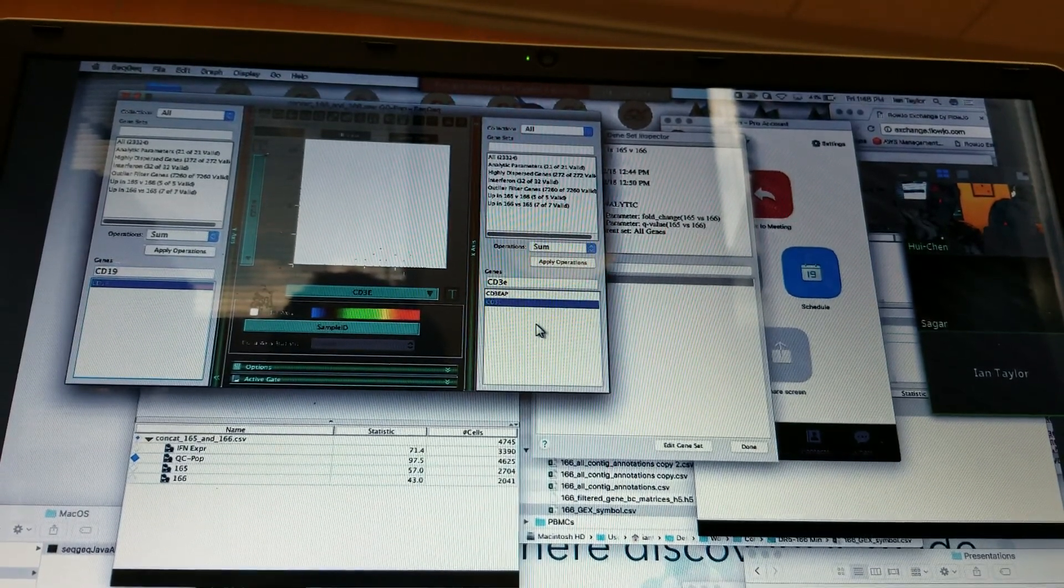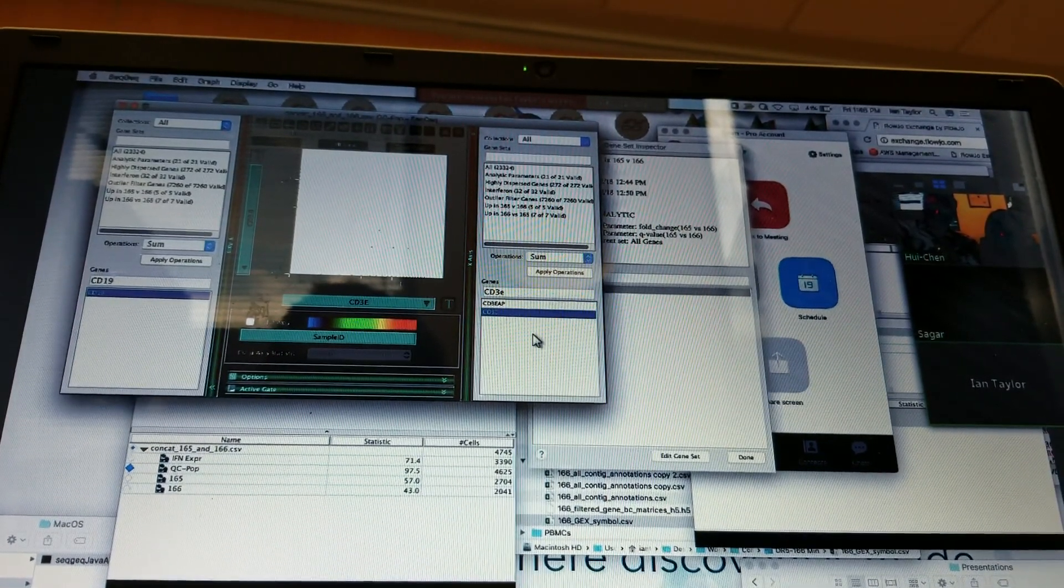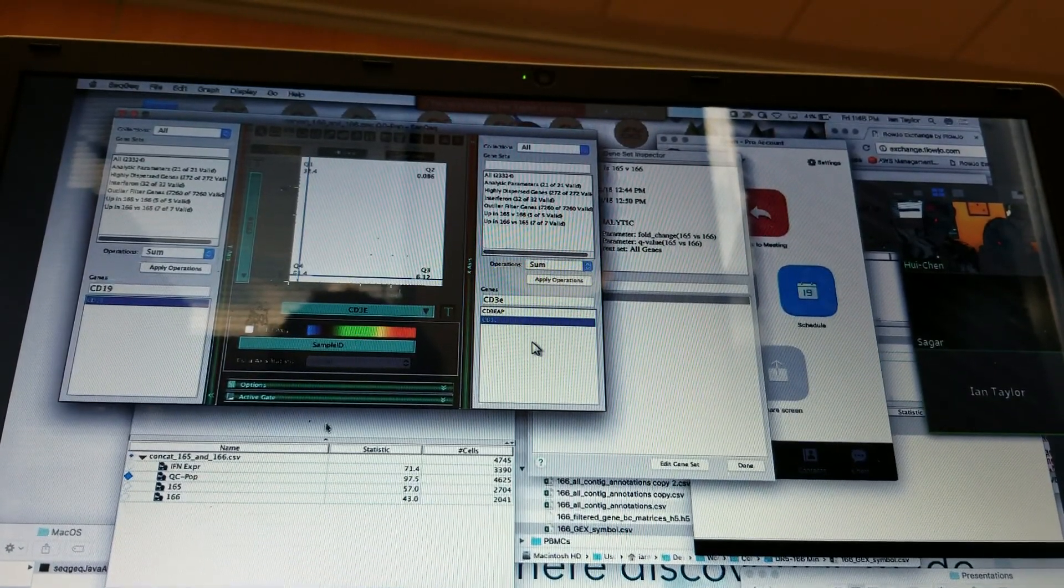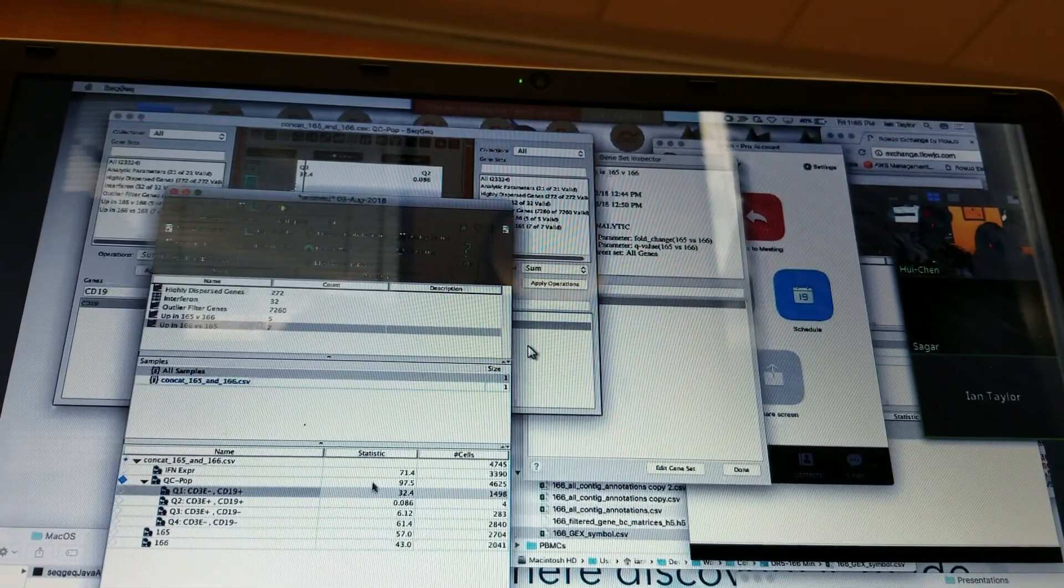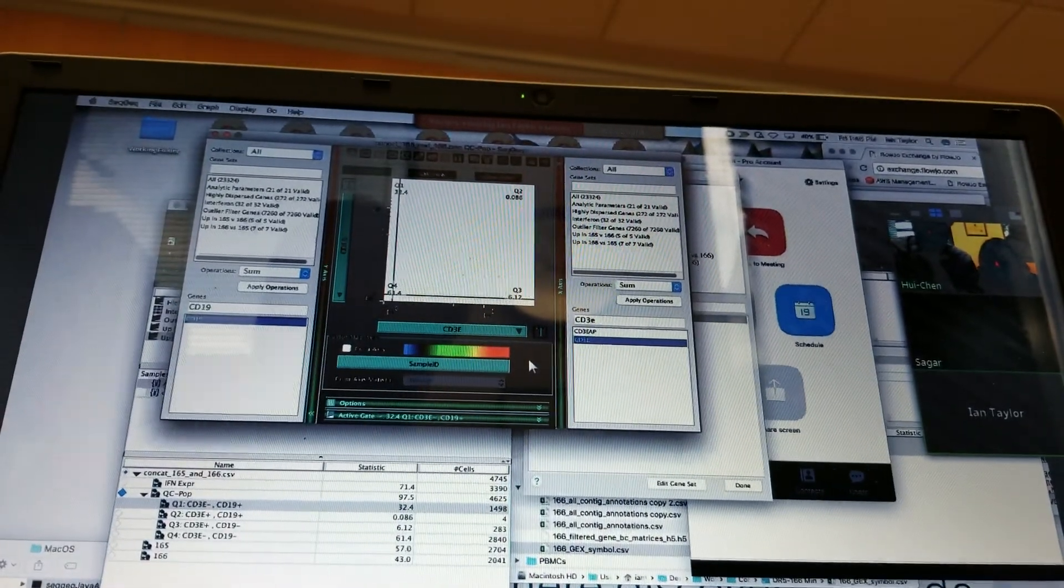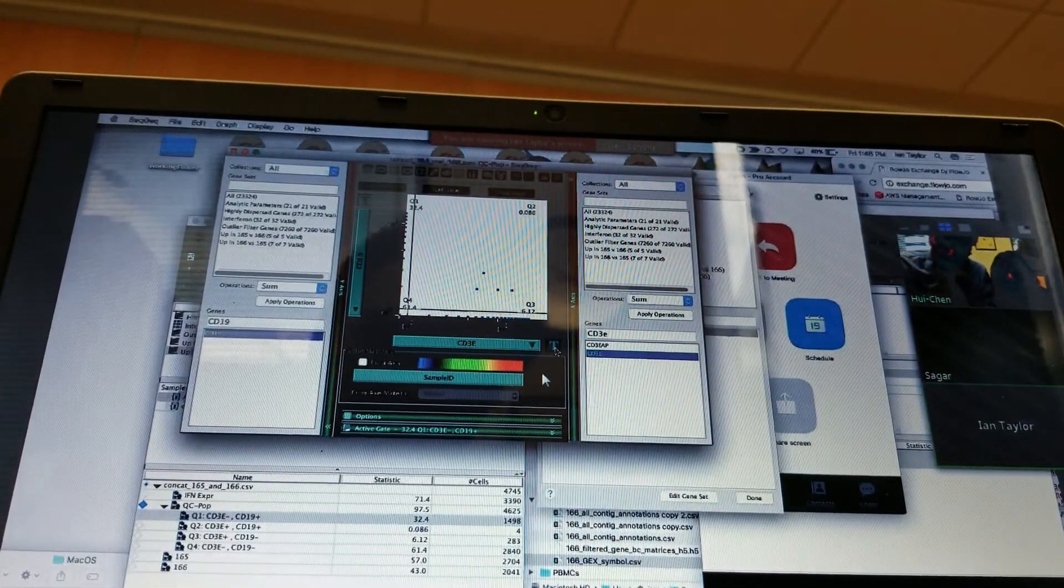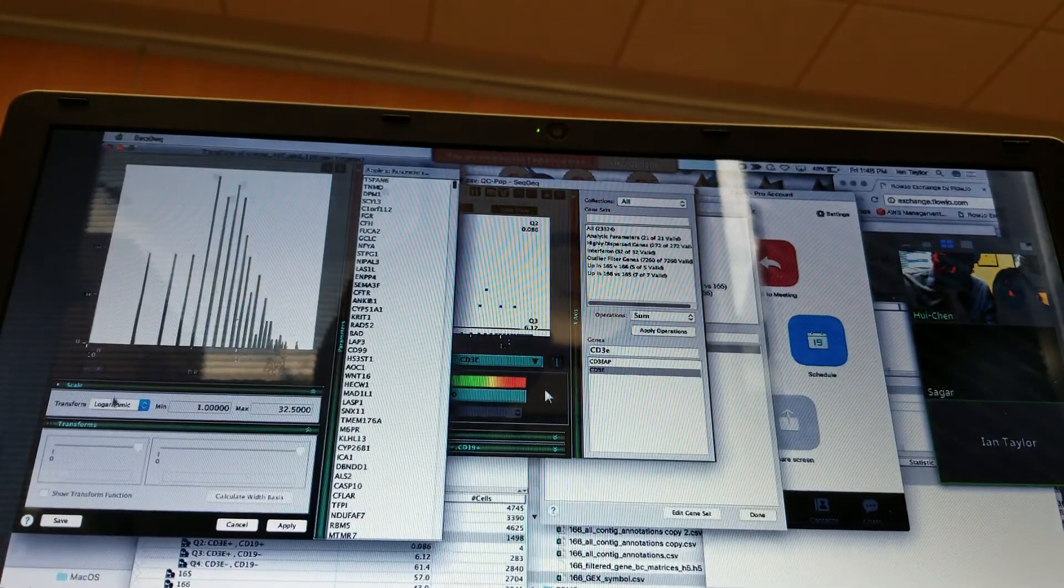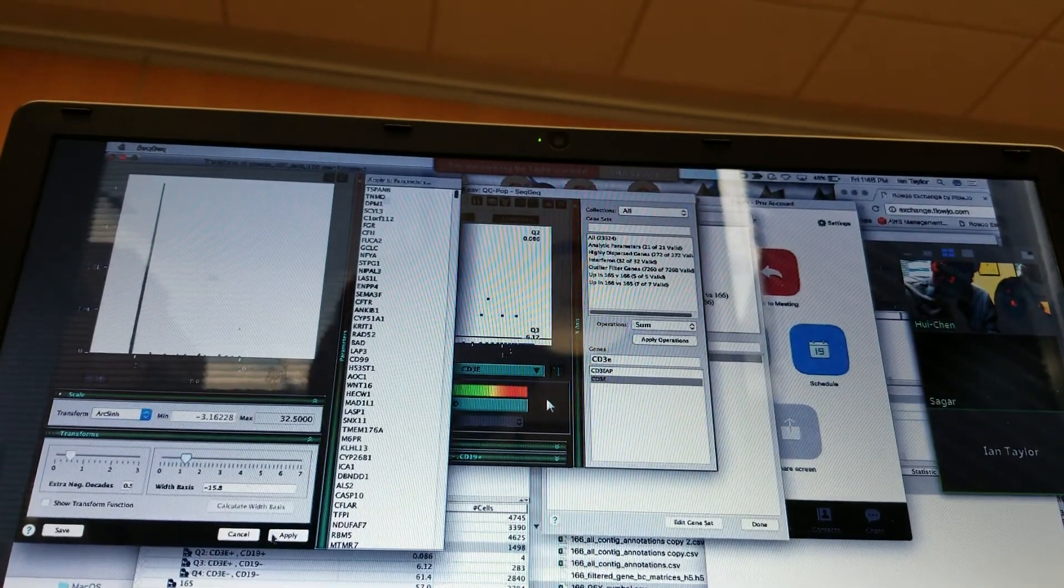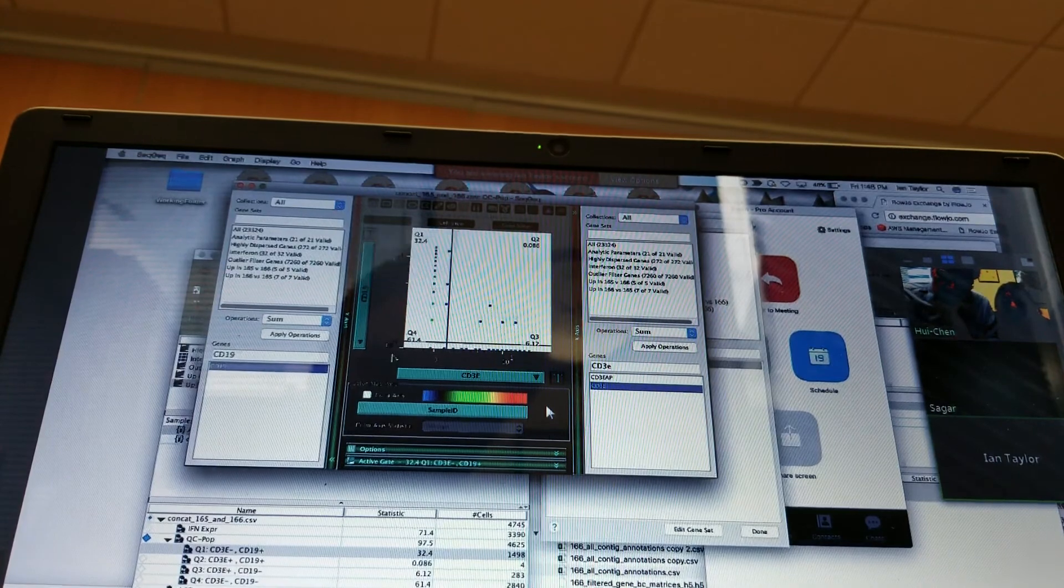Again, this probably isn't the way we would recommend doing cluster identification. Let's see if I have anything in here. So this CD3E minus CD19 positive, those are probably our B-cells. They're in the plot. Because everything's smashed on the axis here, it looks a little bit funny. Let me try and clear that up a little bit. The large dots will help. I can also change the axis, customize the axis, and maybe make like an arc sine axis.